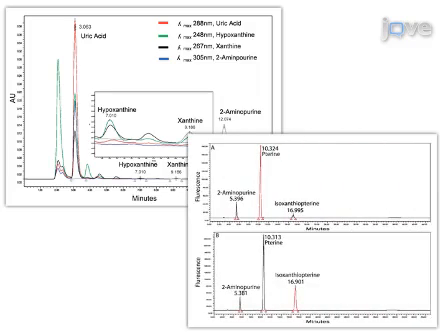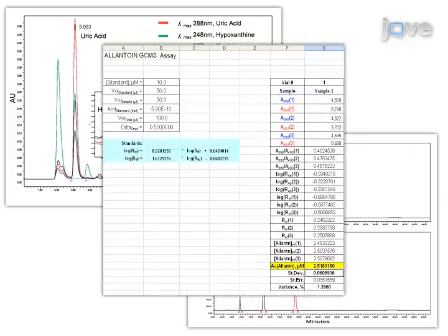Ultimately, results are obtained that show chromatograms of peak areas, which can be converted into molar concentrations of the desired biochemical markers or enzyme activity via standard curves.